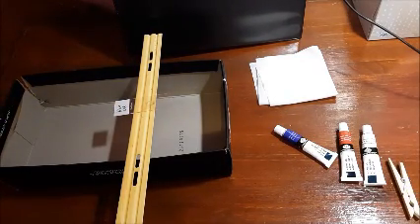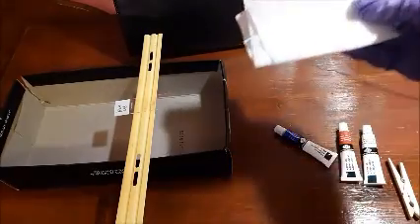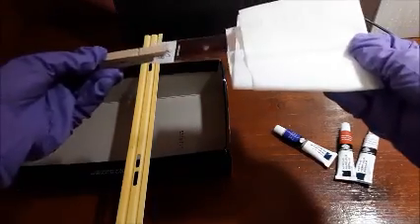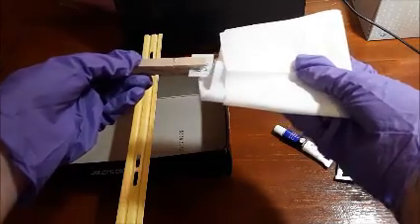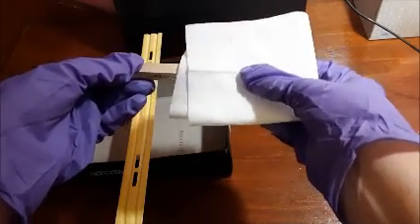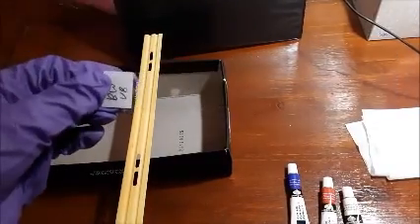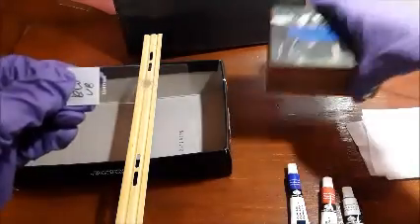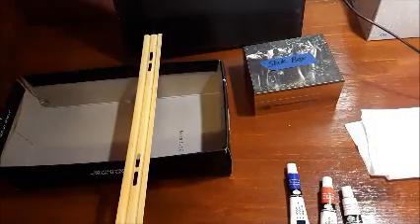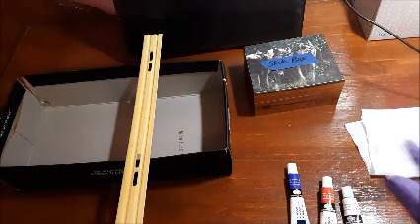Once you've done that, you can now blot dry your slide. To make it easier, I'm going to pick up my slide clip and put the slide in my book of bibulous paper and just gently rub the slide. You want to do it until it's completely dry. Once it's dry, you can now view your slide under the microscope. Once you have viewed your slide under the microscope, just put it back in the slide box. Remember, after viewing and analyzing the slide under the microscope, take your slide and put it back in the slide box, which we just did.